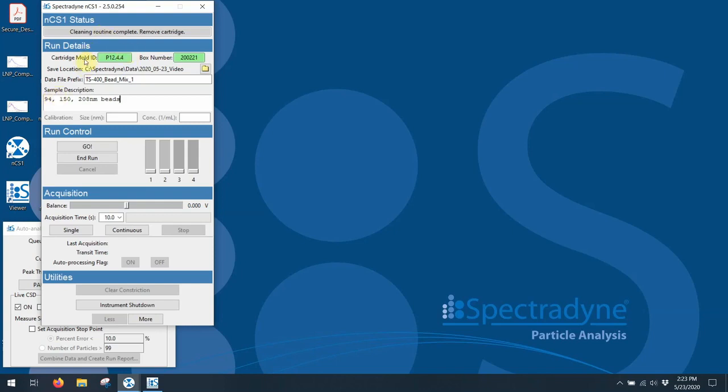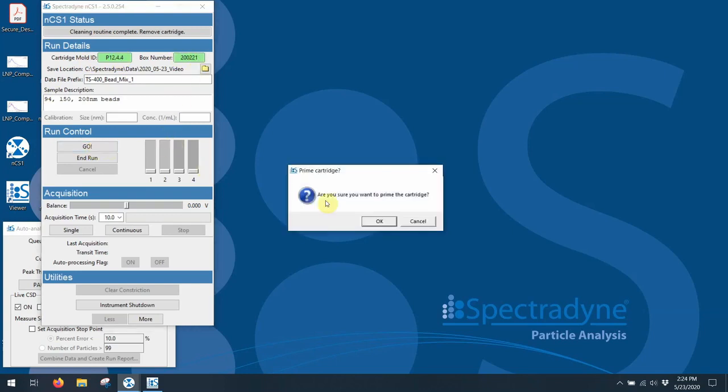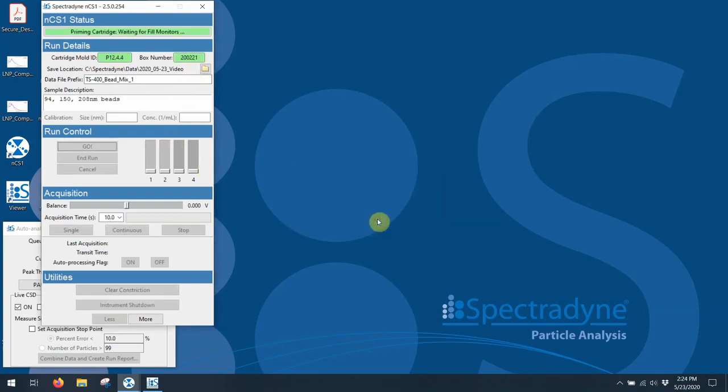Now that everything's all set to go, you can see the green lights are on here. I simply hit go. And at this point, everything is taking over. It's on computer controlled. And at this point, the system will begin to prime the cartridge.